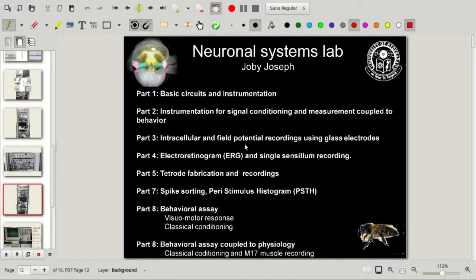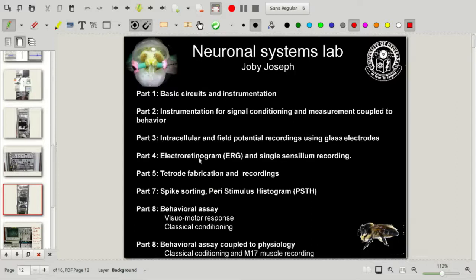Then we will move on to the very commonly used technique of intracellular recordings from single neurons using glass capillaries. A similar electrode can also be used for field potential recordings, and both can be done using glass electrodes. Field potential recording can also be carried out using metal electrodes. Glass capillaries are pulled in a pipette puller to make very sharp ends, filled with an electrolyte inside, and connected to the amplifier using a silver–silver chloride wire. The electrode can be inserted either into the cell for intracellular recording, or into the tissue for field potential recording.